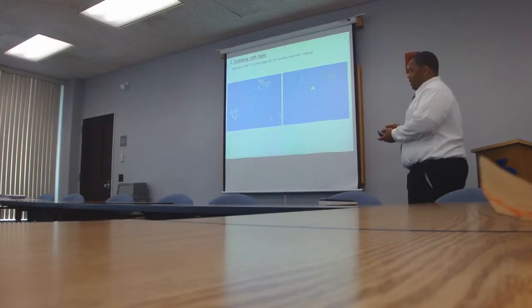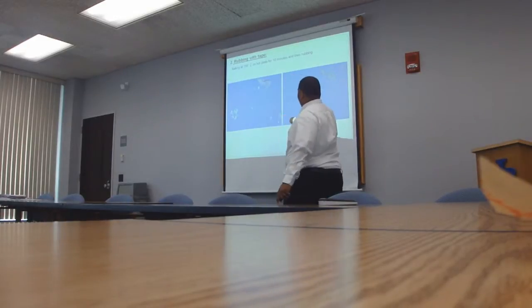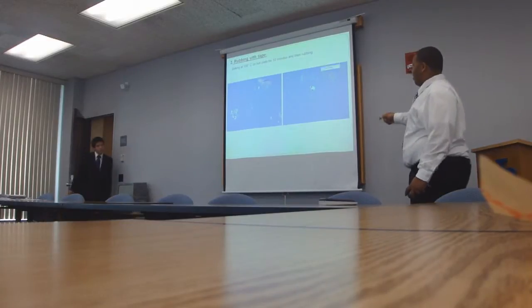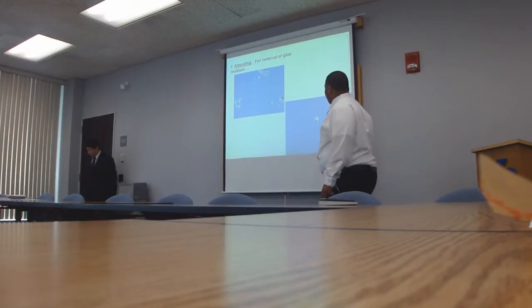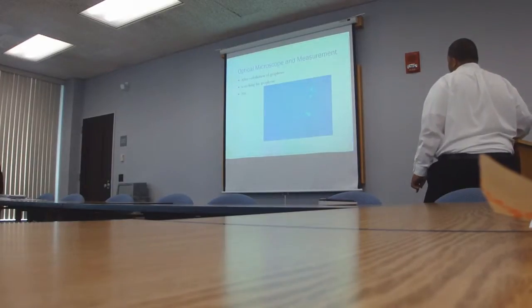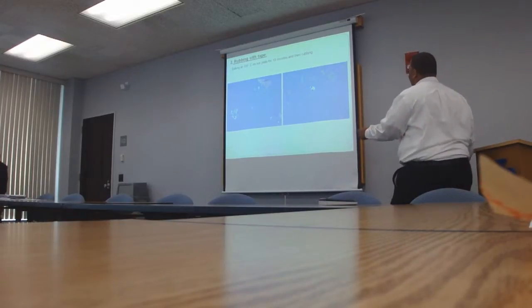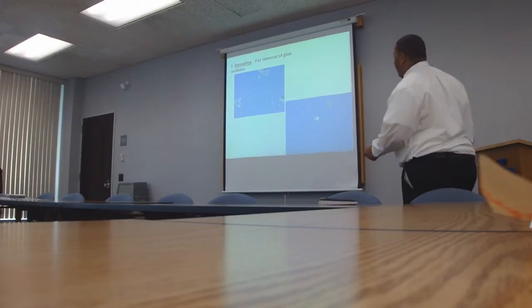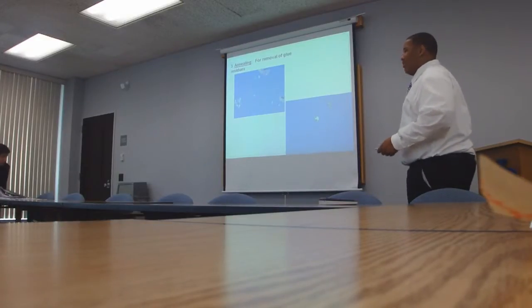When it's applied to the actual wafer, you'll see that you have this residue right here. This is not actually the graphite. This is residue. So it goes through a process of annealing, which is like a cleansing process. As you can see, previously you have all these residues, but after annealing, the residues disappear. It just makes it easier to identify graphene.